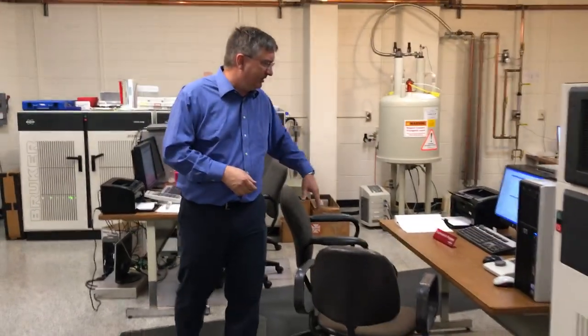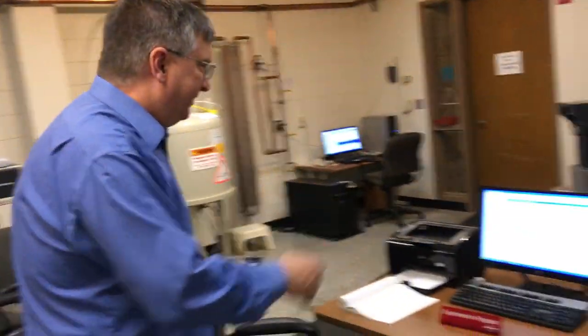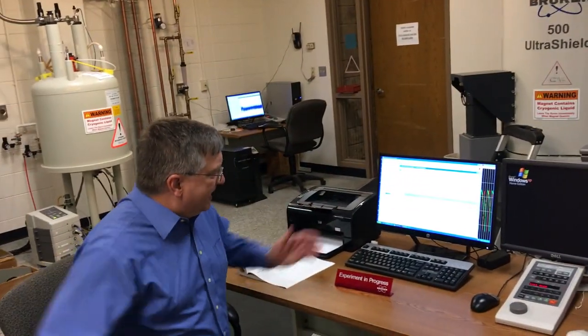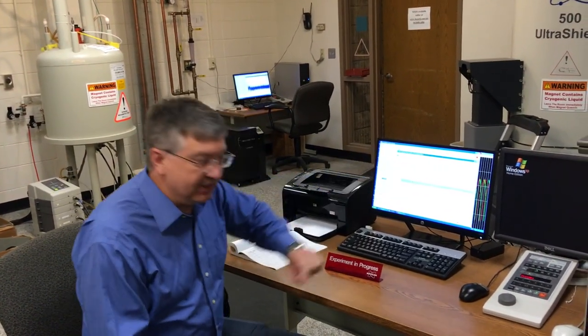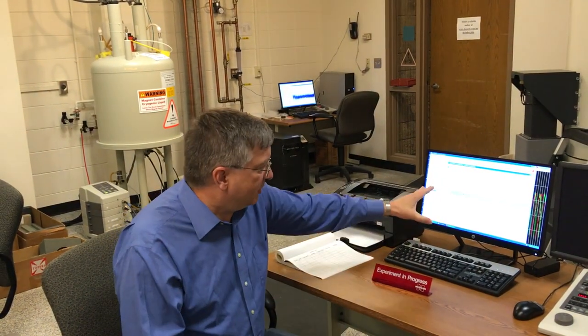Right now this one's running, and you can see data being collected on this 500 MHz NMR. This is what's called a free induction decay — watching the radio frequencies being emitted as the nuclei flip back to their lower energy state after being bombarded with radio frequency waves that flip them the other way. The frequencies associated with this let us figure out the chemical environment of each nucleus, exactly how many electrons are around it, how close it is to other ones, and so on.